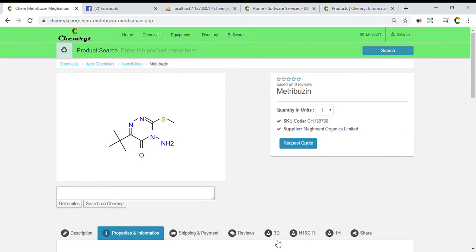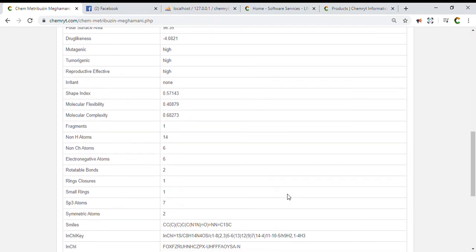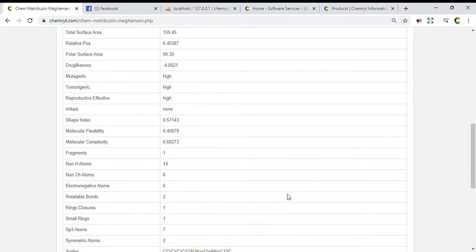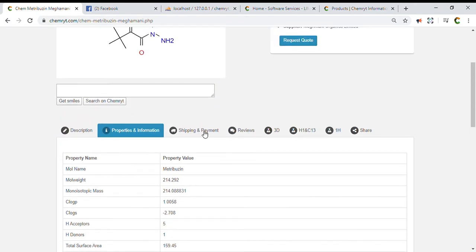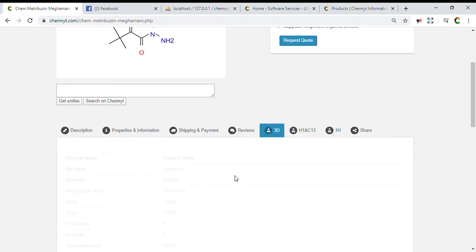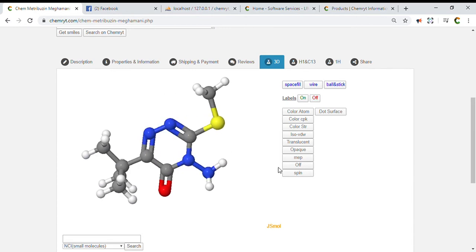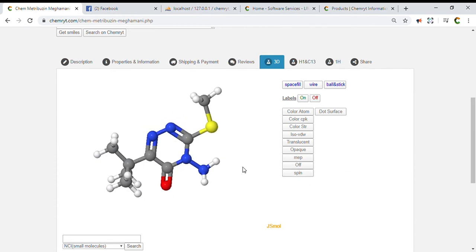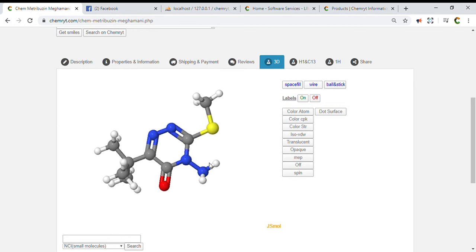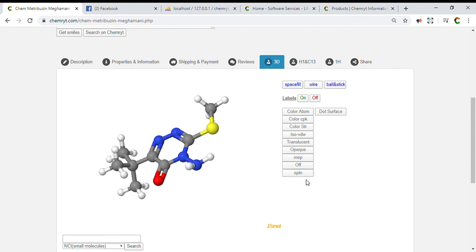Metribuzin. Molecular name: Metribuzin. Molecular weight: 214.292. Monoisotopic mass: 214.088831. LogP: 1.0058. Relative PSA: 0.45387. Polar surface area: 96.35. Drug likeness: minus 4.0821. Mutagenic: high. Tumorigenic: high. Reproductive toxicity noted. Molecular complexity: 0.68273. Fragments: 1. Non-H atoms: 14.